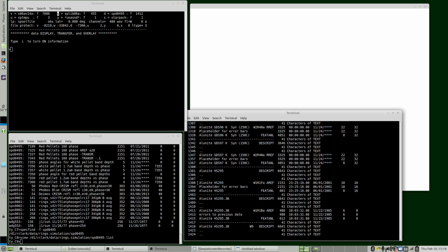to the letter W. So the spectrum that we want to plot is this one. So it's D1411. This is the record number for the wavelengths, D411, capital D6. And notice it has error bars, so we can include the error bars by typing an E here.